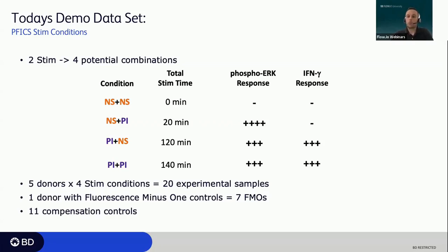That means we put every fluorochrome in this tube except one, and that's the true gating control in flow cytometry for that fluorochrome, because if we didn't put that fluorochrome, we should not have any staining, so we know exactly where to put the gate. And we also ran our 11 compensation controls, which are our 9 single stain colors plus 2 unstained: cells and unstained beads.